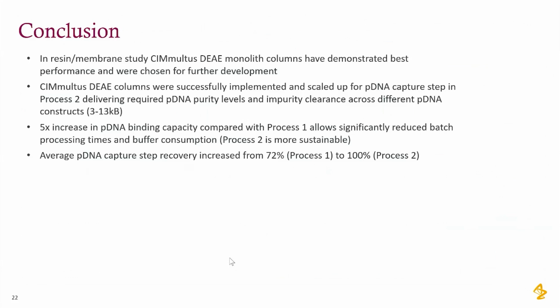We got a 5-fold increase in pDNA binding capacity compared with process 1. And that increase allows us to reduce batch processing times and our buffer consumption, so an environmentally friendly change. And average pDNA capture step recovery increased from 72% in process 1 to 100% that we have now in process 2.